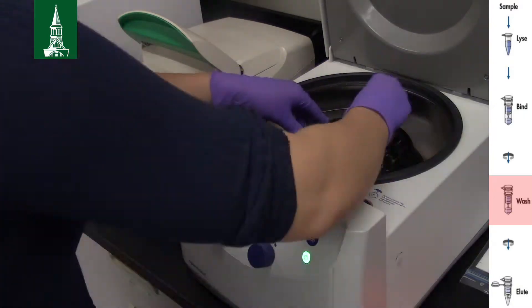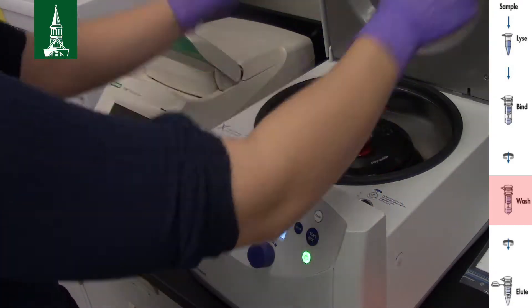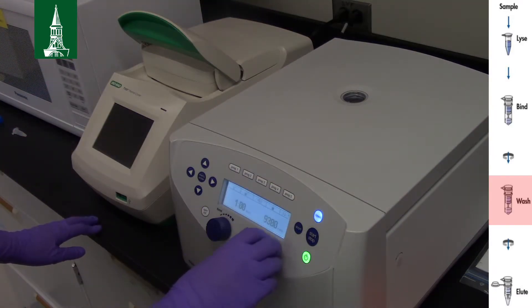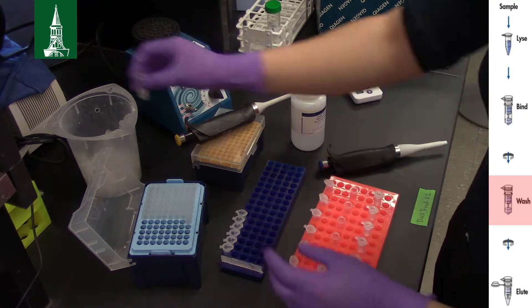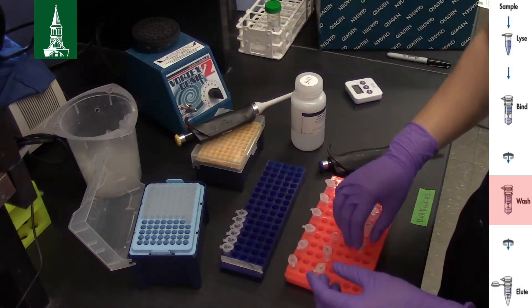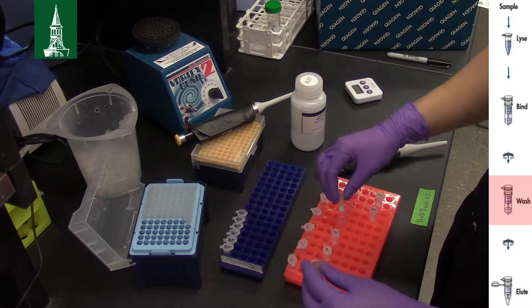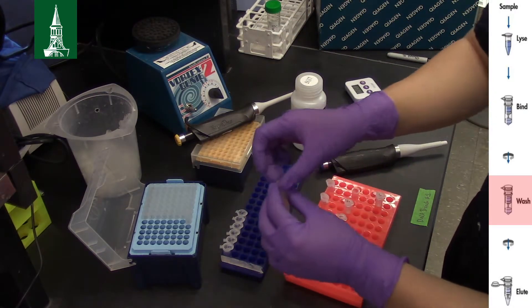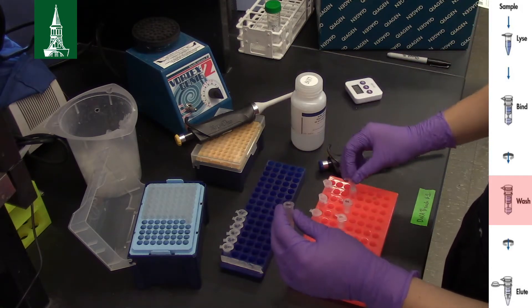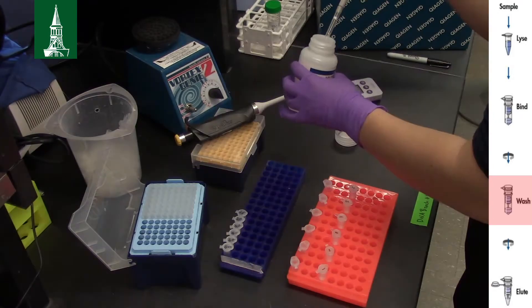Centrifuge at 8000 rpm for 1 minute. Again, discard the collection tube with flow-through and place the spin column in a new 2 ml collection tube. Add 500 µl of buffer AW2.